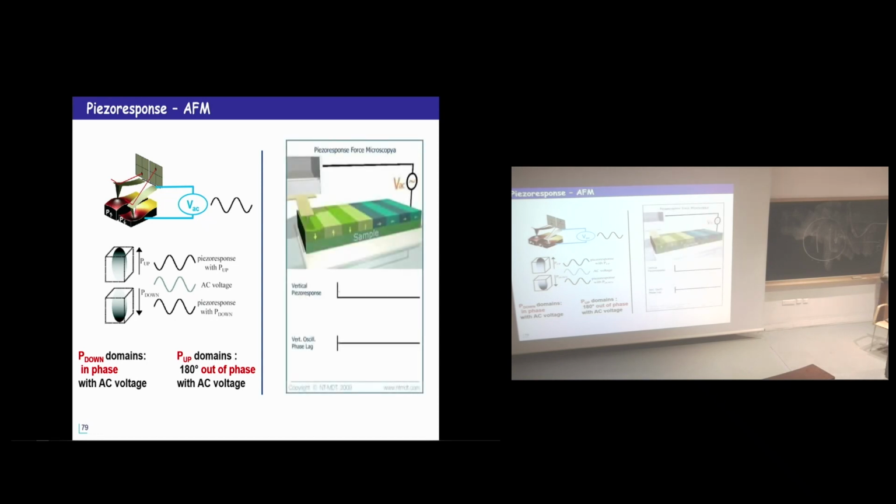So this is how it works. Yes, I told you it's a very nice talk for a post-lunch session. Okay, this is what's going on. Here you see the amplitude of oscillation is the same in all domains, but the phase lag is 180 degrees.